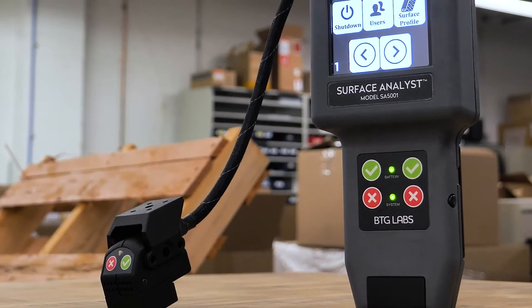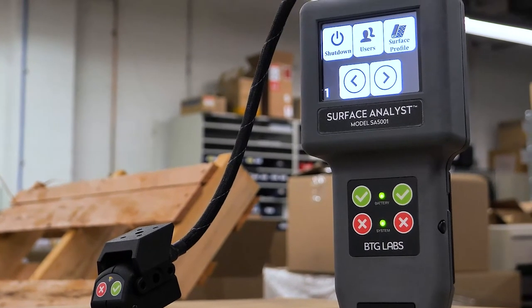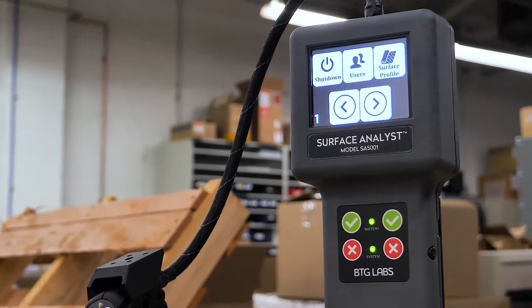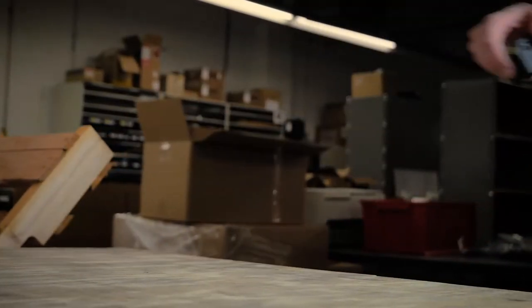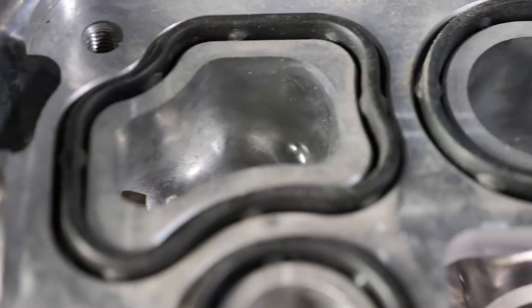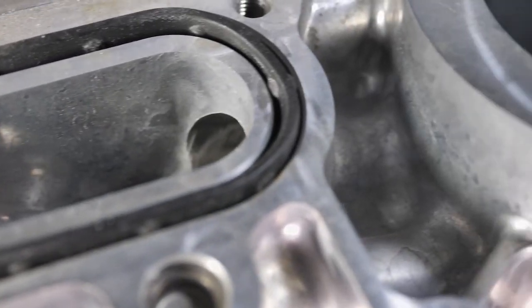The Surface Analyst 5001 was designed to take complicated surface analysis measurements out of the lab and put them directly on the manufacturing floor. In doing this, the Surface Analyst 5001 allows for inspections on any material in any direction and on parts with complex geometries.